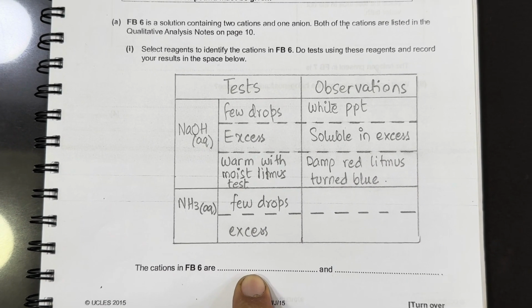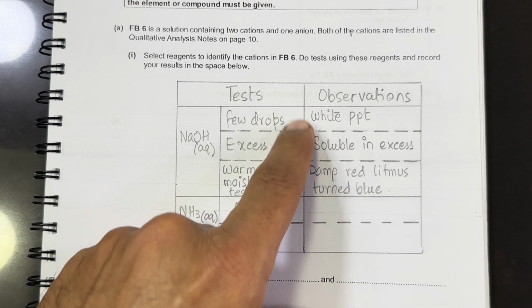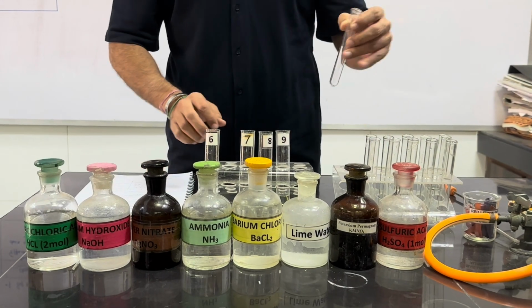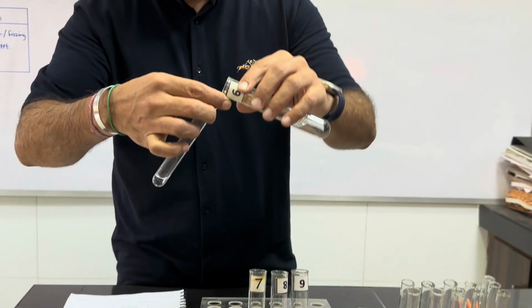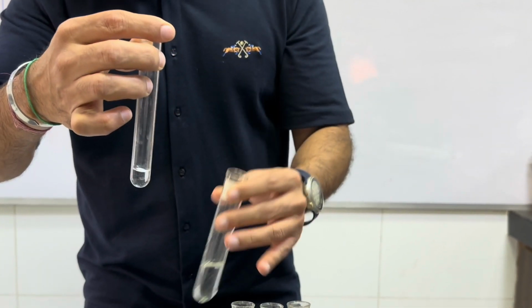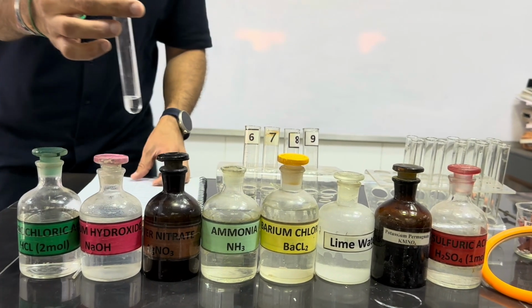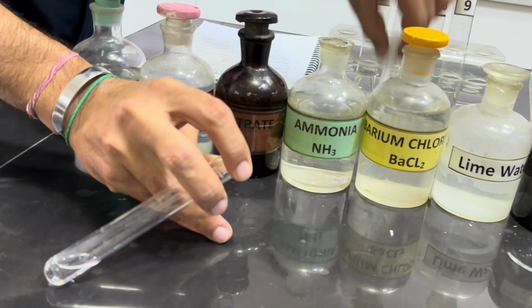Now we are testing for the second ion, which has given an observation with sodium hydroxide, but we will test with ammonia also, then we will confirm. Now we will take again 1 centimeter sample of this solution, and we will add aqueous ammonia. We will add aqueous ammonia dropwise first, followed by excess.